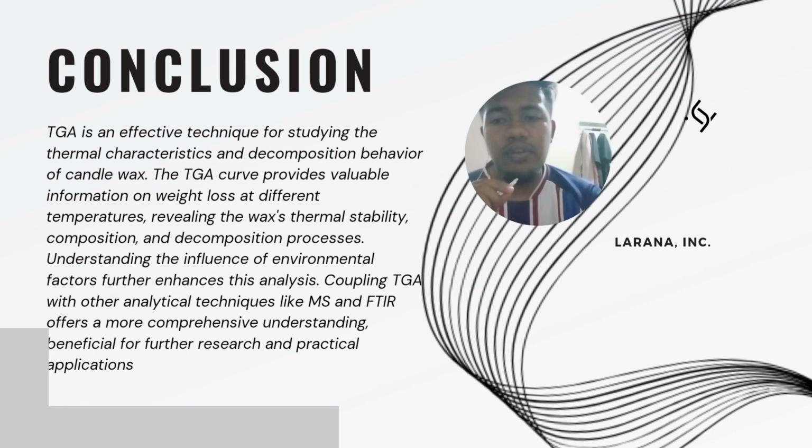Coupling TGA with other analytical techniques like MS and FTIR offers a more comprehensive understanding, beneficial for further research and practical application.